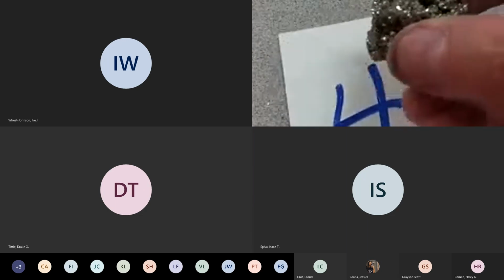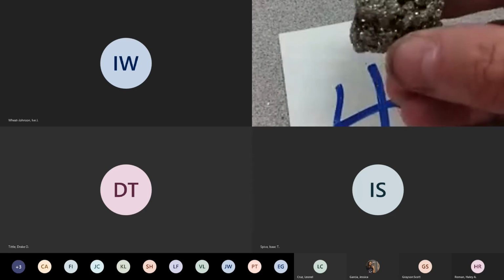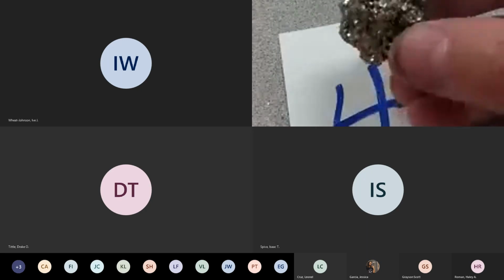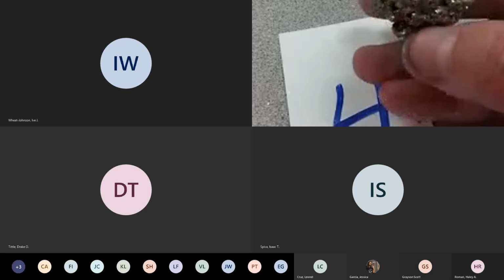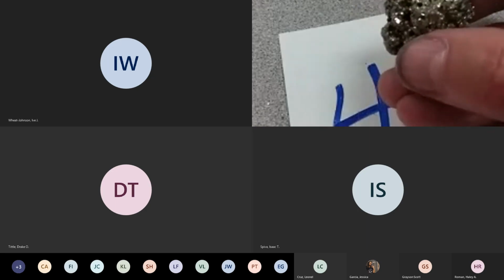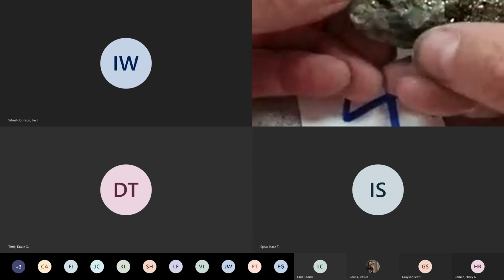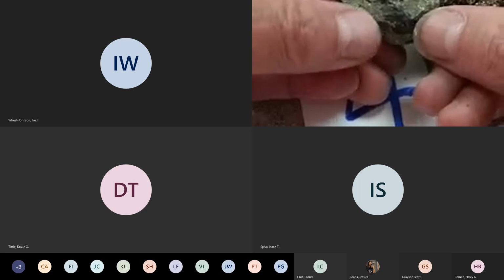The only one that I'd really kind of disagree with a little bit would be the tinfoil, because I think of tinfoil as being silvery, and this is brassy. I'm not going to tell you yes or no on what it is yet, but the fact that some of you can't tell if it's gold or silver, that's kind of a problem for us. So if you ever are not clear on the color, then asking me would be helpful. This is another version of the same thing, and I don't know if you can tell that it's closer to gold than silver.